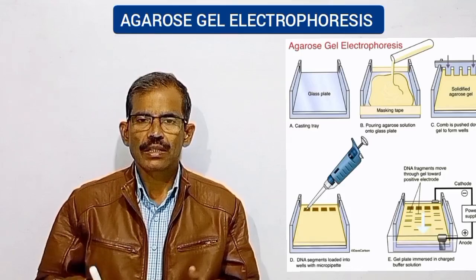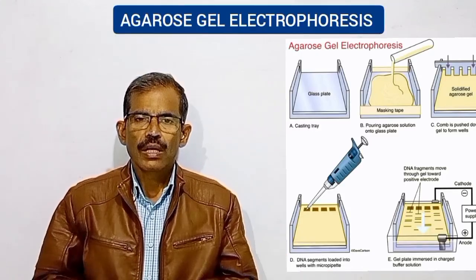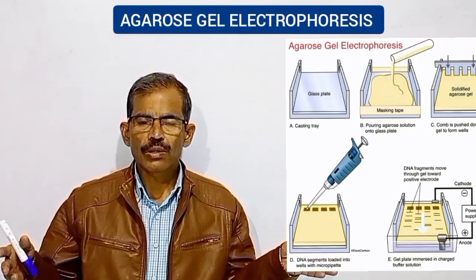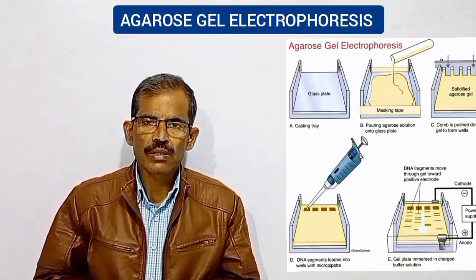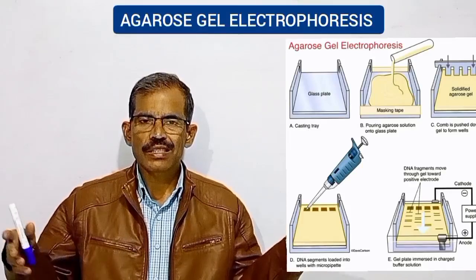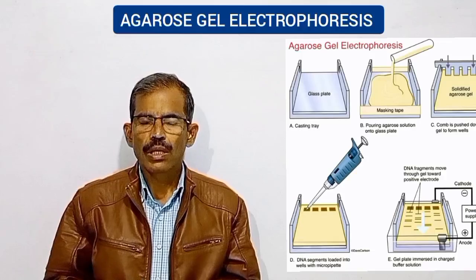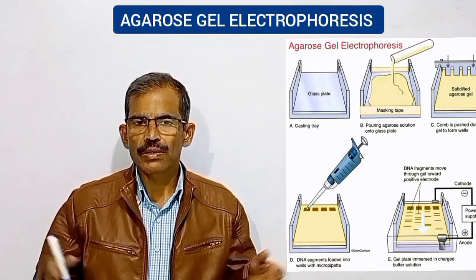Agarose gel is a three-dimensional matrix consisting of helical agarose molecules in supercoiled bundles that are aggregated into a three-dimensional structure with pores and channels through which biomolecules can pass.